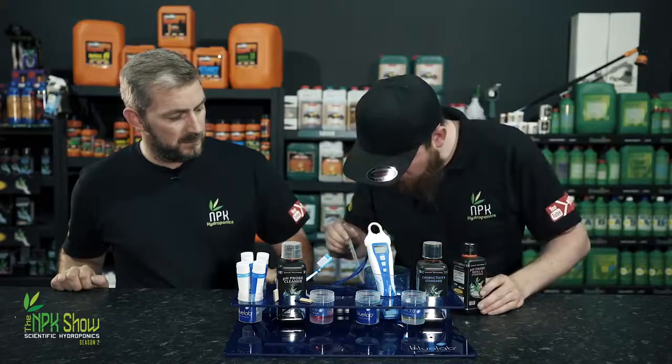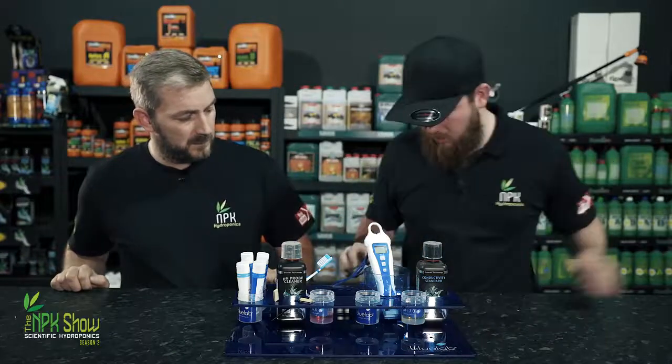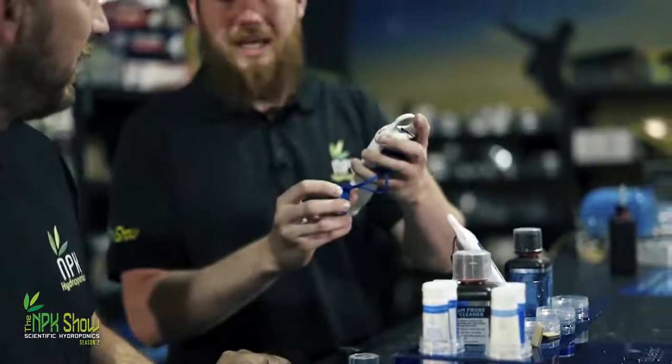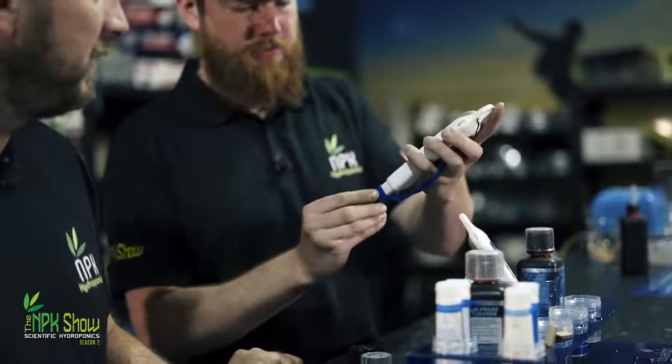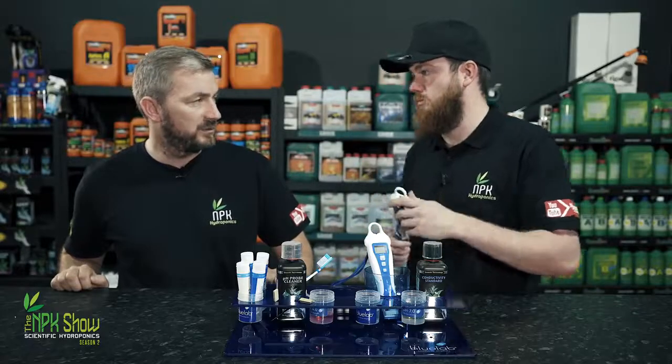Pipette some out, put some into your cap. They are a good piece of kit. If you look after them, they will last you, like, 12 months guarantee. I've got an EC truncheon that I've had for about 5 years now, and it's still going strong.